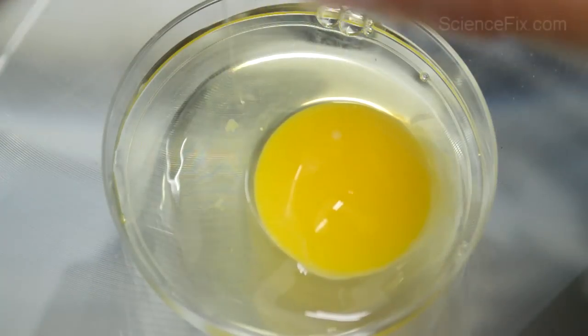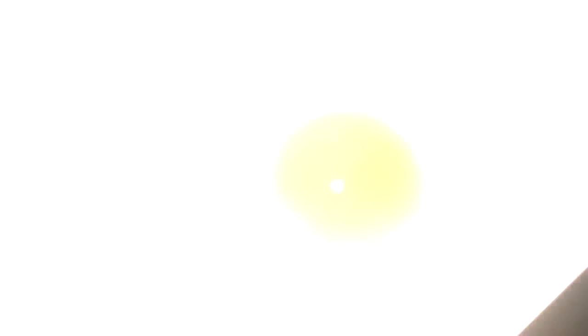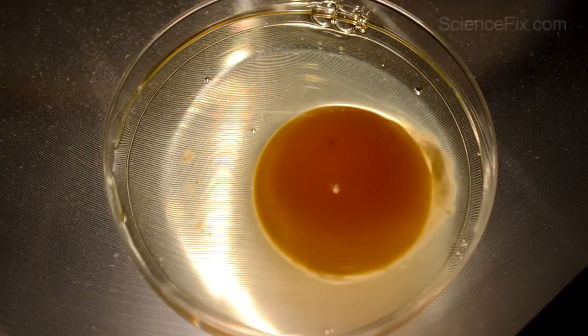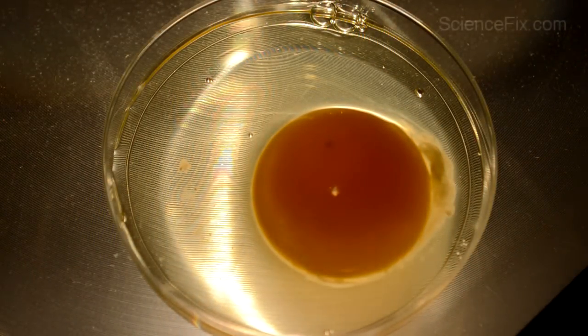So here's a little demo where you can show them, concretely, why it's so important to wear those goggles. An egg is placed into a petri dish, and the petri dish is placed onto an overhead projector.